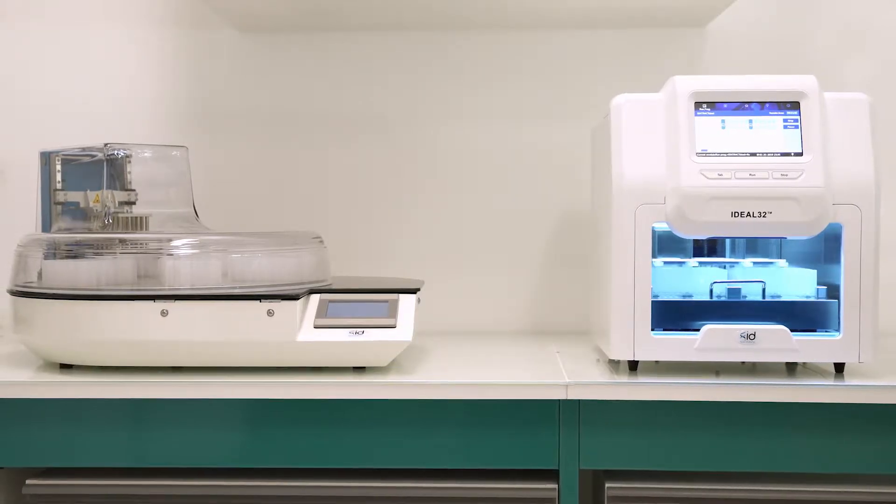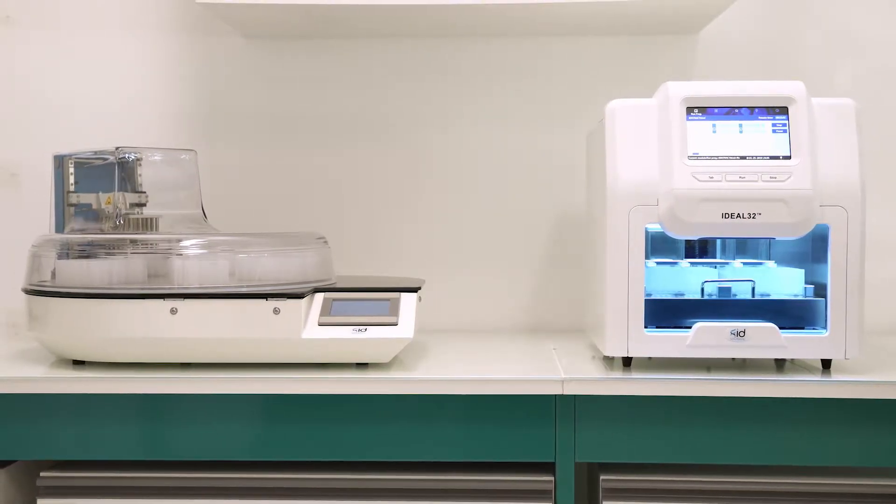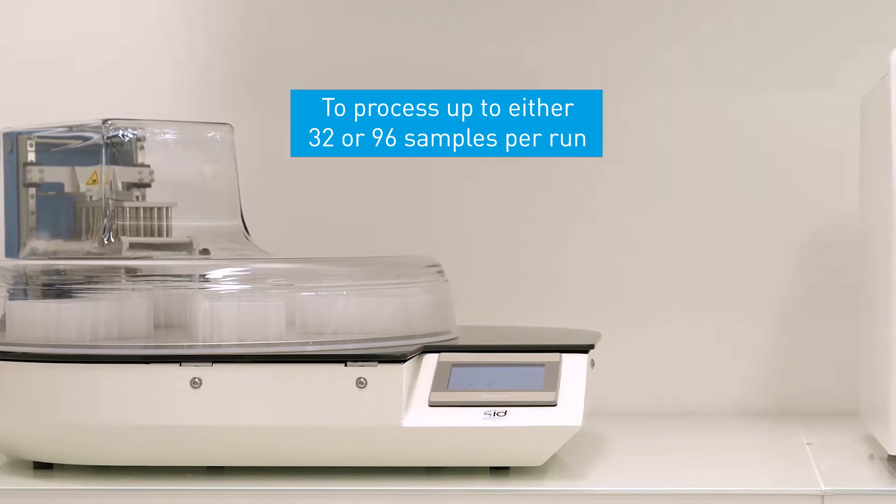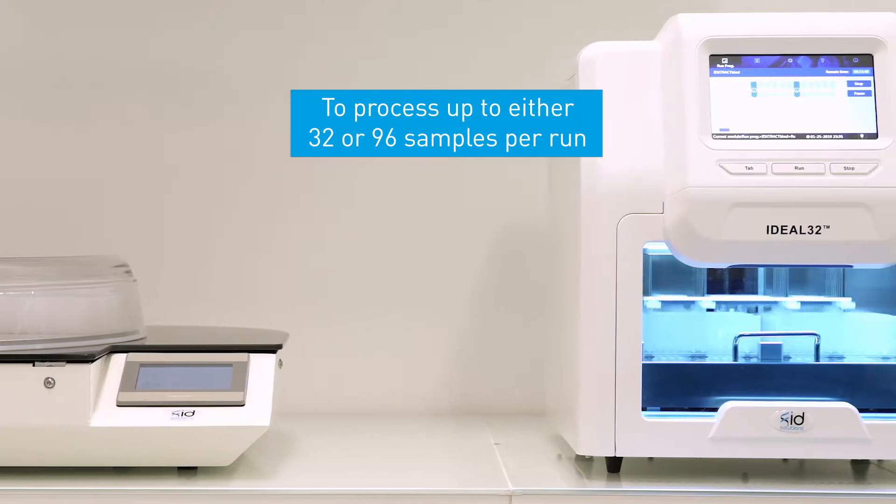We are pleased to present our range of ideal robots for the automated extraction of DNA or RNA. These robots use magnetic bead technology to process up to 32 or 96 samples per run.